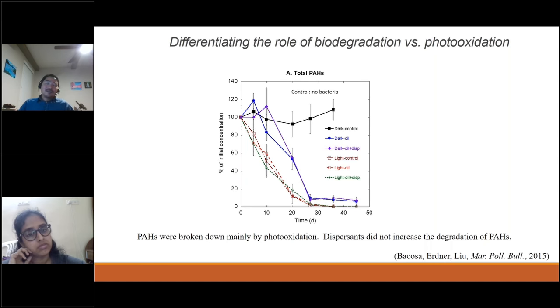This question is great. It relates to photogenerated saturated hydrocarbons. Some folks in the community think there are a lot of saturated hydrocarbons, but they really come from the alkyl tail of the PAH. So the alkylated PAH is being converted to saturated hydrocarbons. That's where they come from. A couple of papers I published demonstrate that really well. So the short answer is that for straight chain saturated hydrocarbons, usually you don't have the sunlight effect, but you do have evaporation. When you do the experiment, the smaller molecules tend to be a little bit more volatile, so you have to be careful with that.